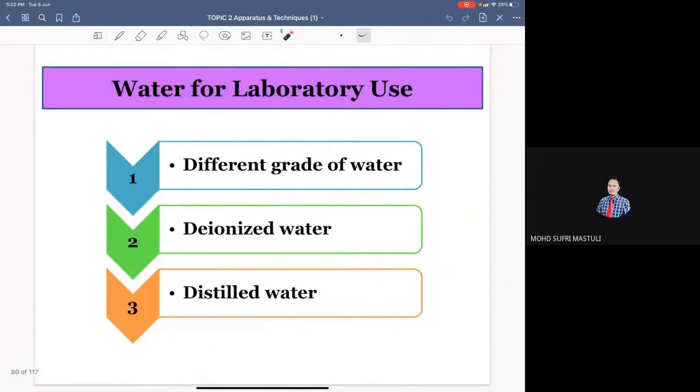All right. So that's all for this video. We discussed volumetric glassware and non-volumetric glassware: the volumetric flask, graduated cylinder, pipette, and also burette.